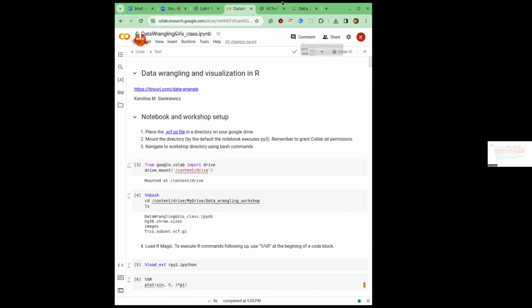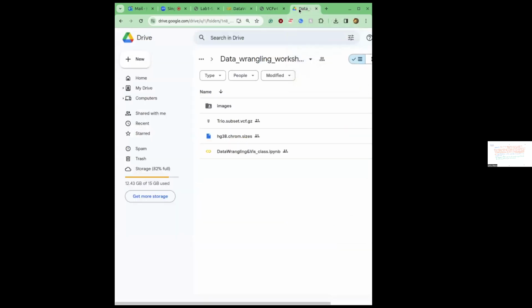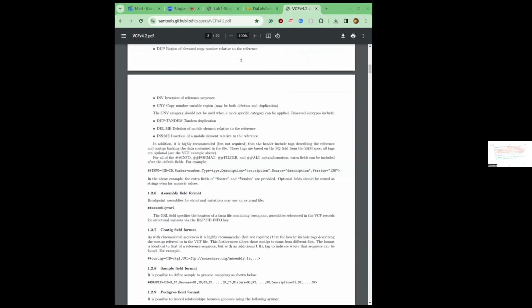All right, let me check. Directory should be readable for everyone. Let me check. Is this the same issue that was before? Not sure. Yeah, cannot change working directory, and then I try to paste it to read a file. It says non-readable or does not exist. All right, can you try now? Cannot change working directory. All right.